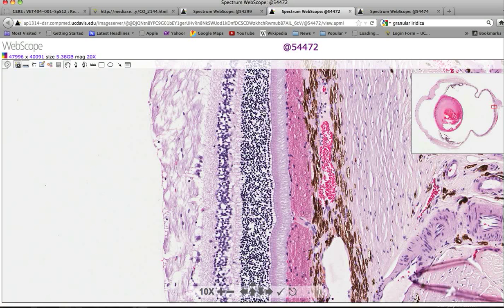We're starting at a relatively high magnification view of the feline retina. Recognize the tapetum. The vitreous is to the left, so that's inner, and this is the sclera. We're very close to the optic nerve, so we can move without a whole lot of motion sickness to the outflow. And we're going to follow the light.